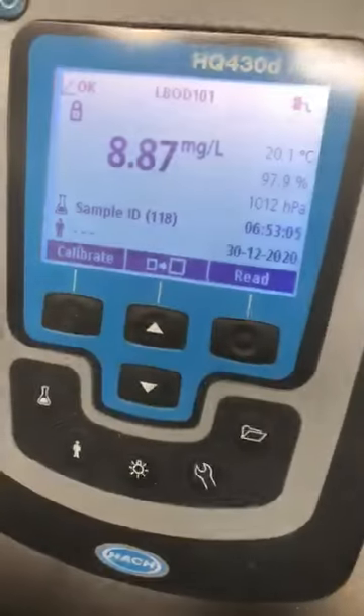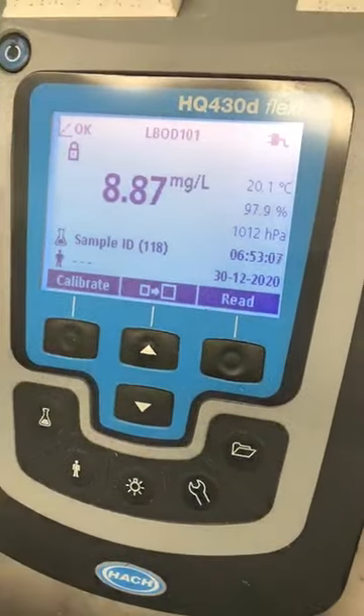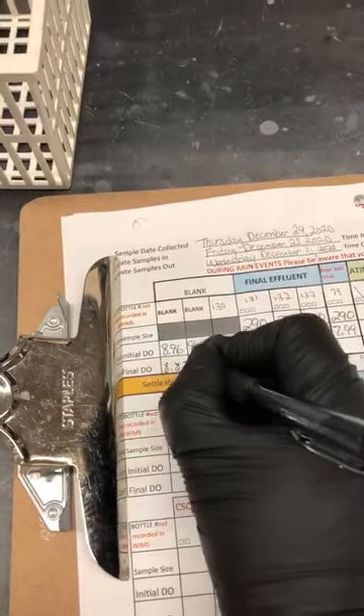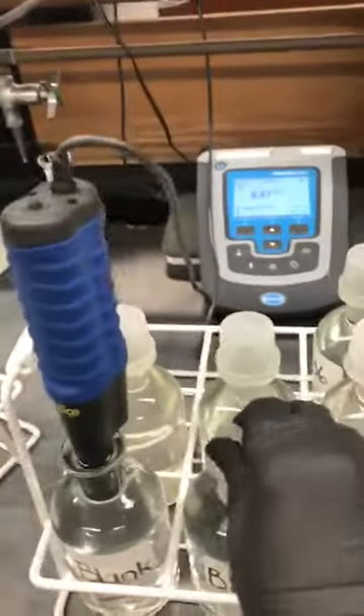So it's locked and ready. It says 887. Now we grab our writer and I write it down: 887. Then go to the next one.